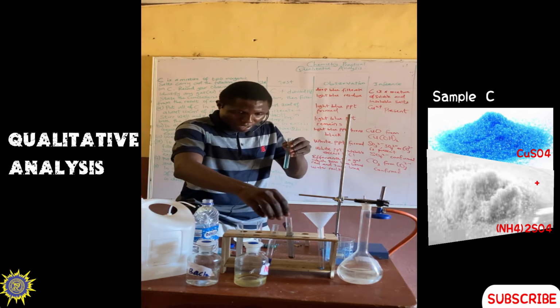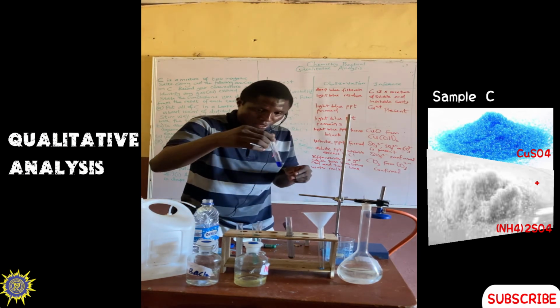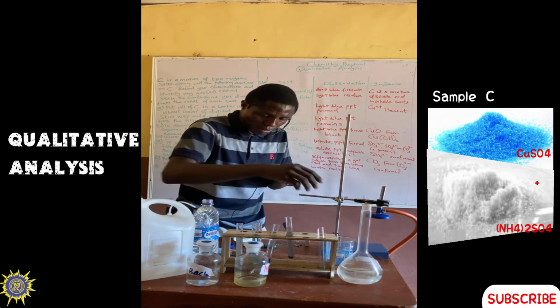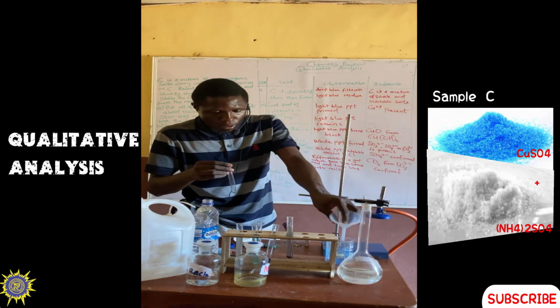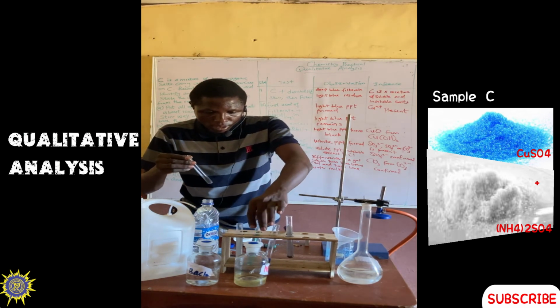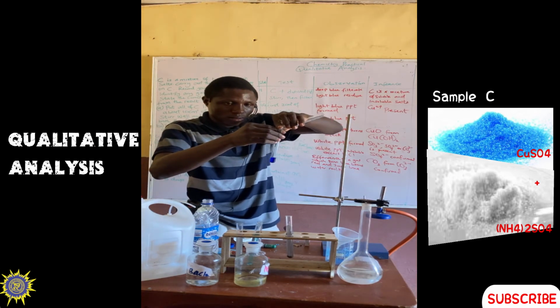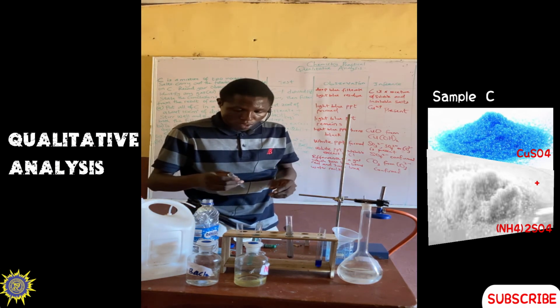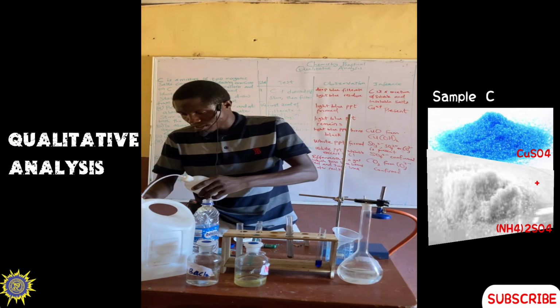So try to create another test tube to empty this one, since we are not using this one again. Or we can as well turn this one to this, because I want us to have the results. Turn this to this so as to have... So let me quickly mix this with my distilled water.